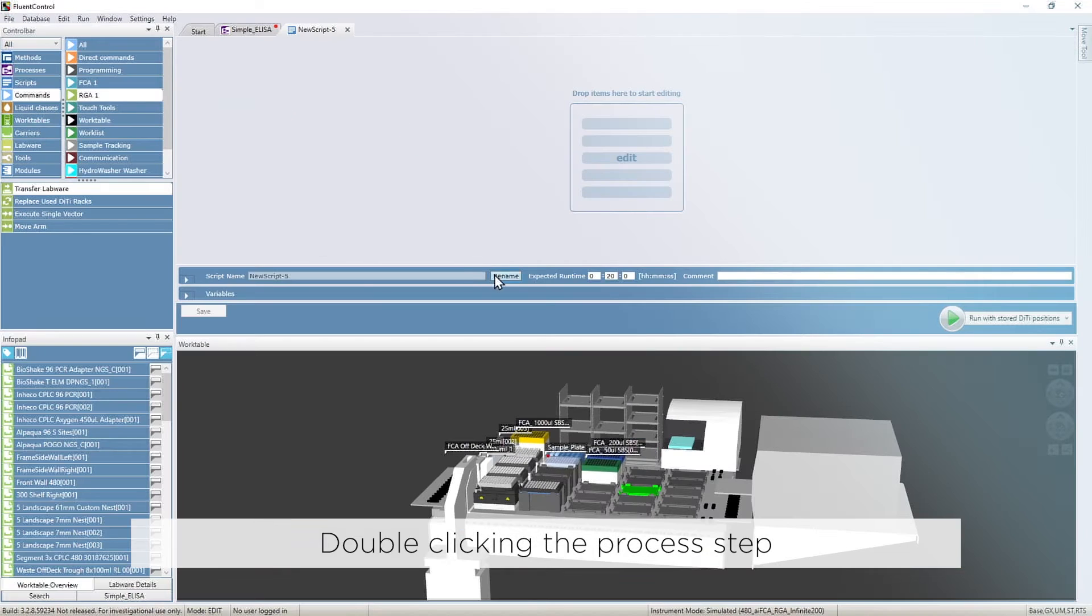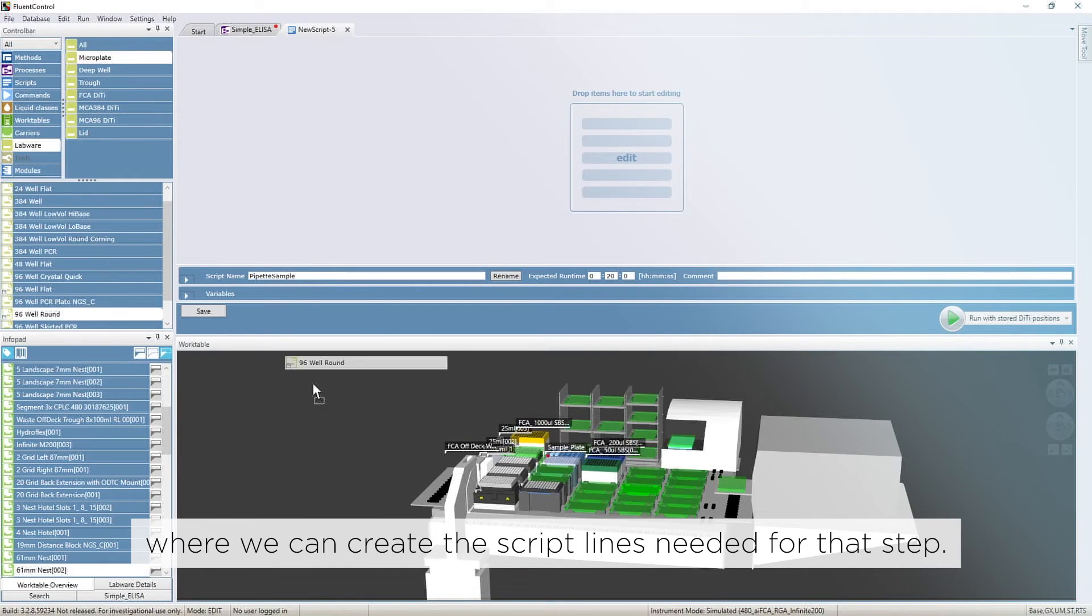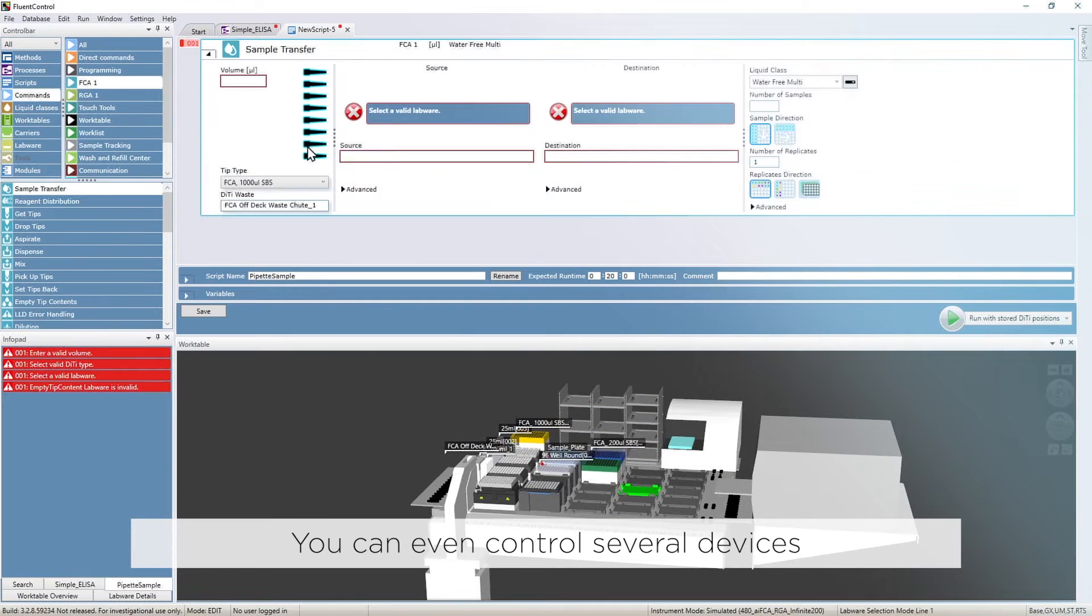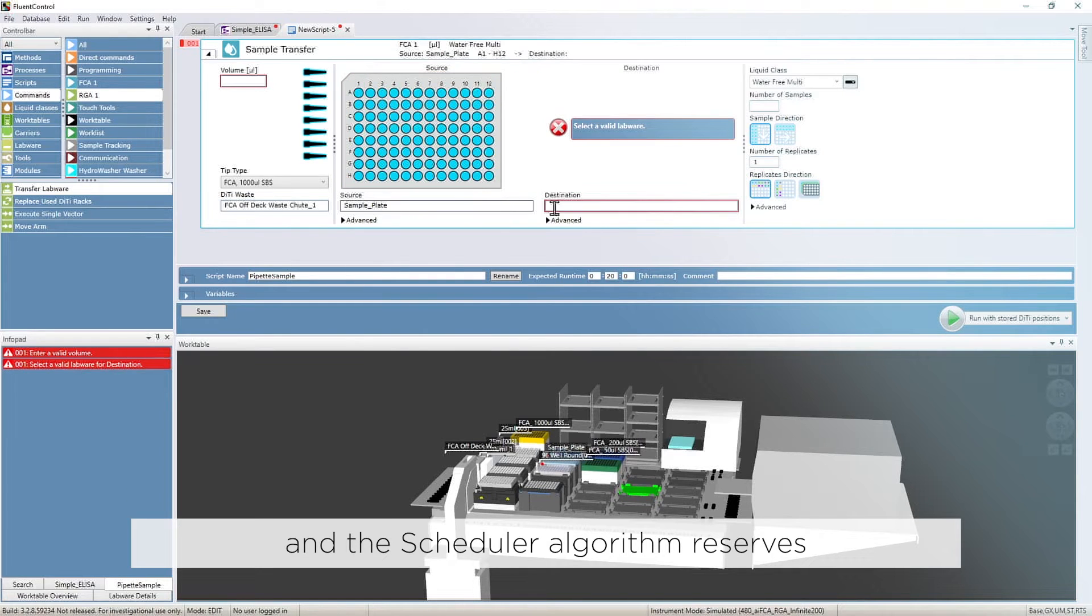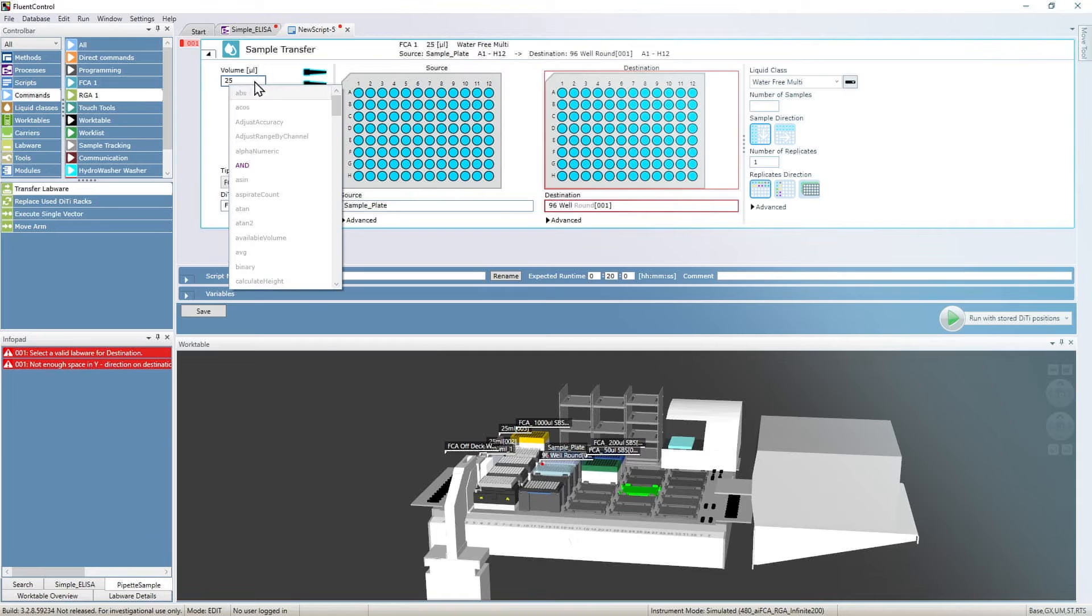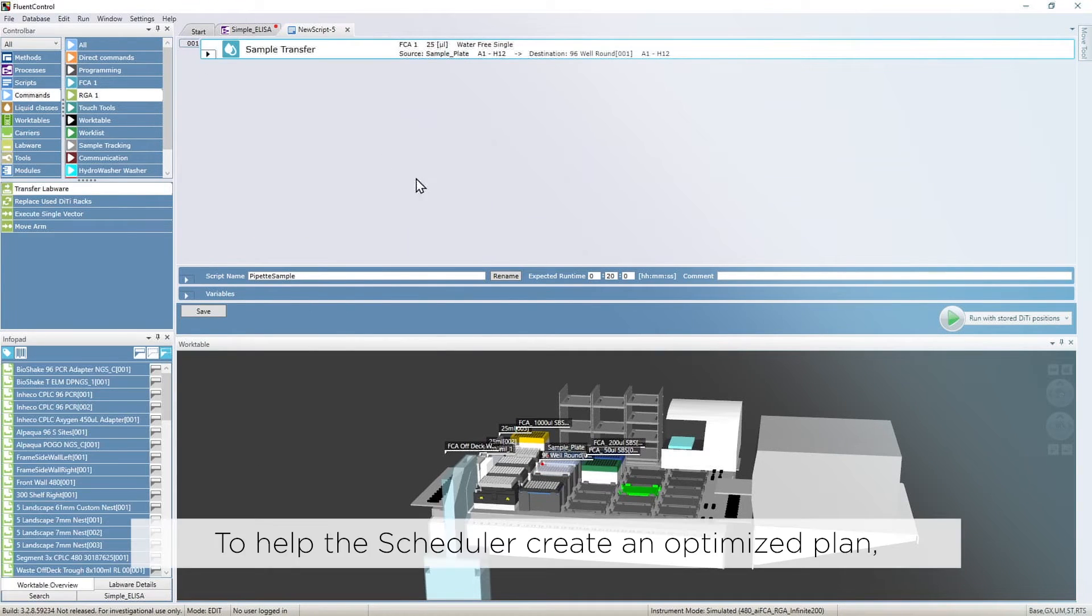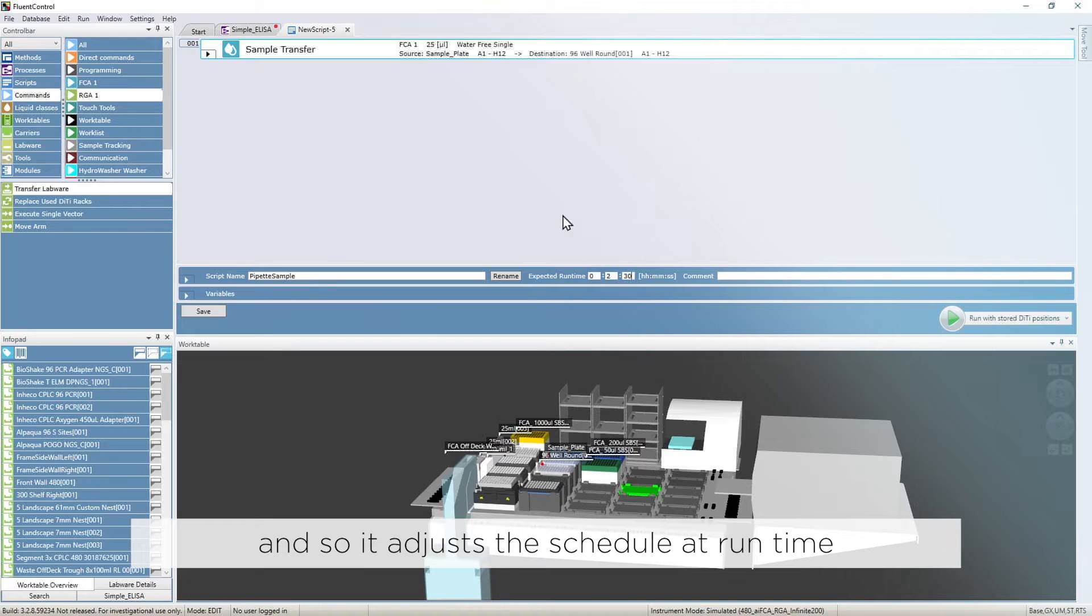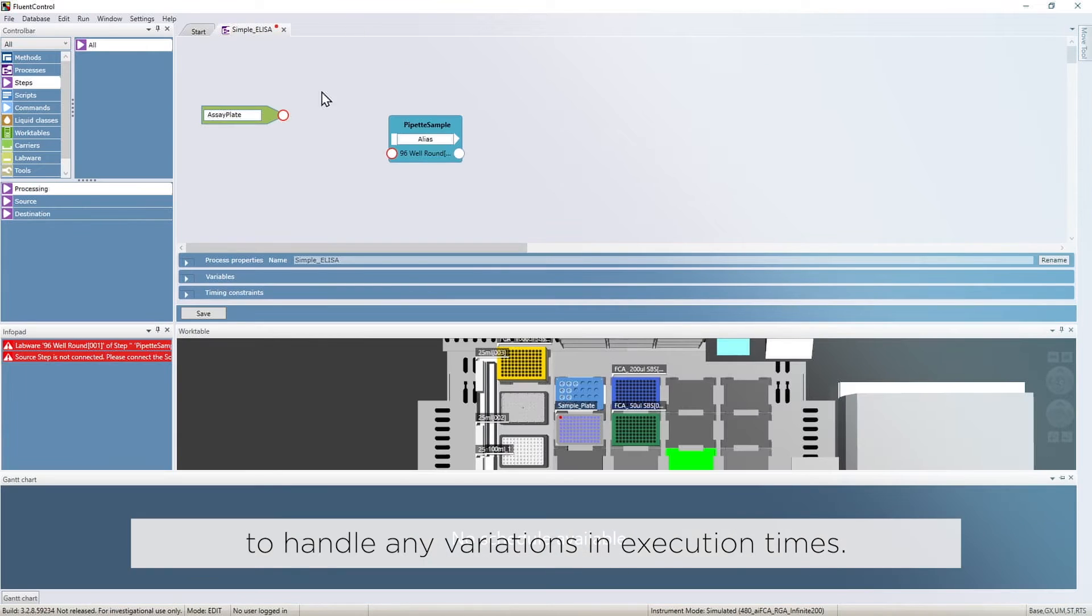Double-clicking the process step opens up the script editor where we can create the script lines needed for that step. You can even control several devices from within one script node and the scheduler algorithm reserves those devices in the plan. To help the scheduler create an optimized plan, we define the expected duration for each step. The scheduler is dynamic and so it adjusts the schedule at runtime to handle any variations in execution times.